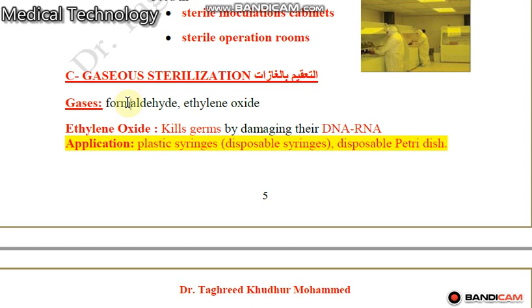And it's very efficient at killing all microorganisms, but it's very dangerous because it's carcinogenic.